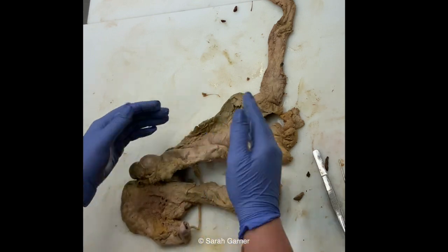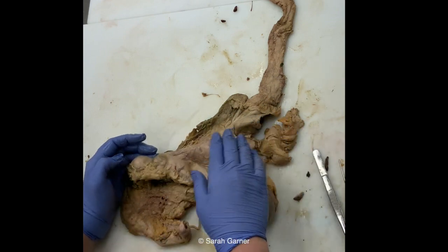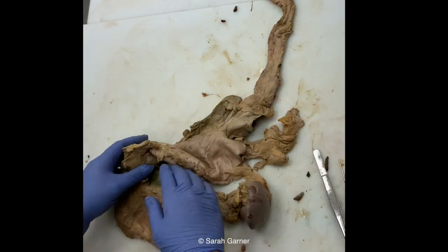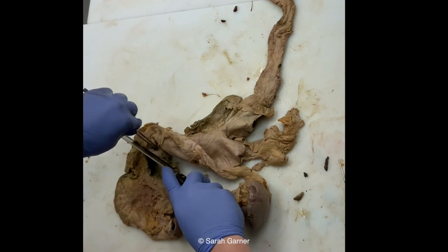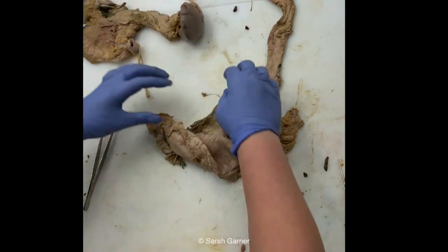So with this, basically you'll want to open up the esophagus and stomach and inspect the full inside. And then same thing with this part. So you can leave these attached, you can separate them, it doesn't really matter. I'm just going to separate them for simplicity here. Okay, so we'll do this one next. So first I'm going to start with the stomach.